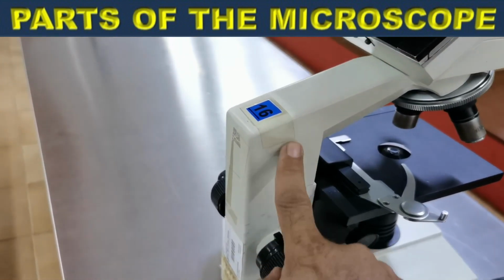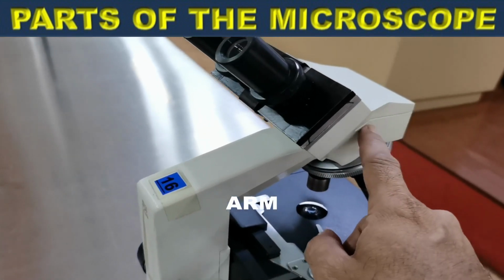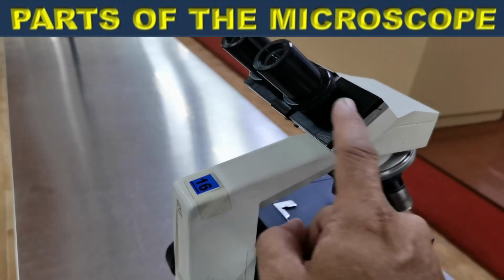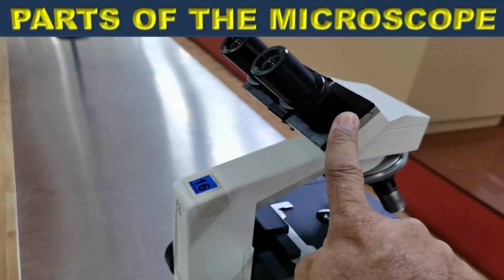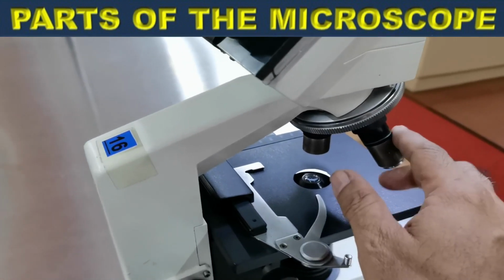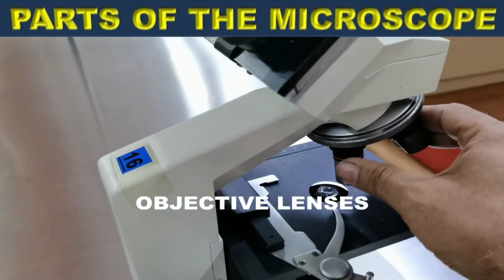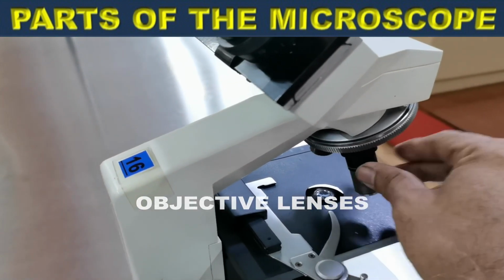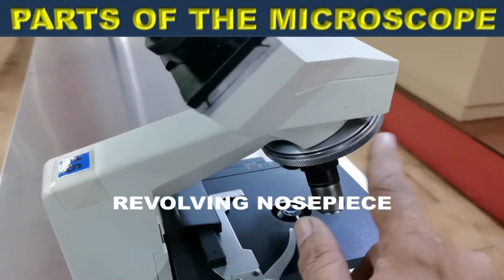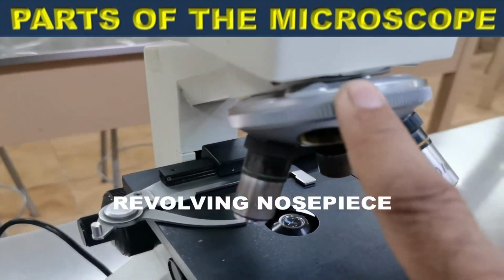Alright, then we have here the arm. The arm of the microscope supports the optical components, like the objective lenses here and the eyepiece right here. Alright, now we have here the objective lenses, and the objective lenses can be moved using this one. This is what we call the revolving nose piece. Alright, so this is the revolving nose piece.